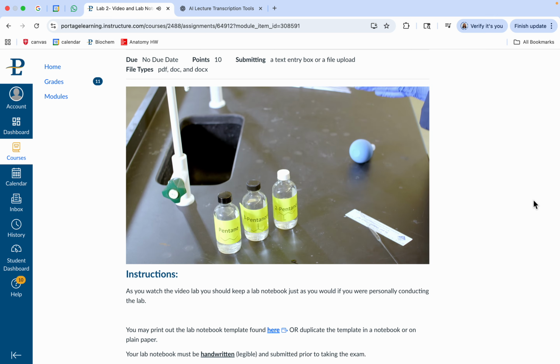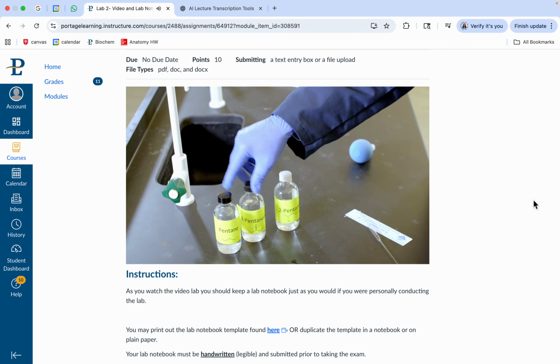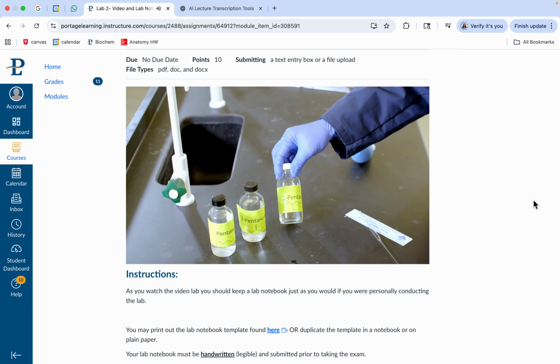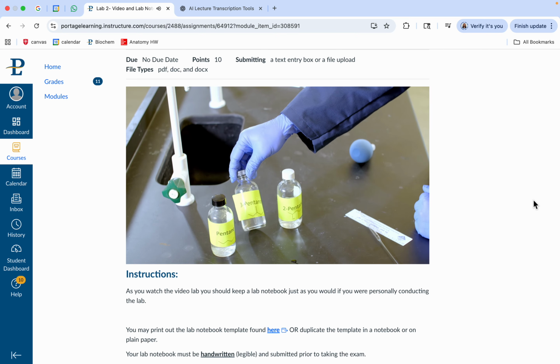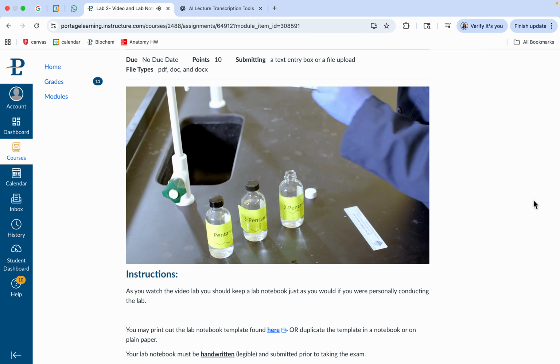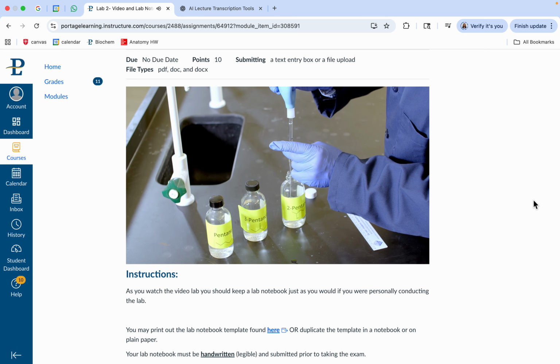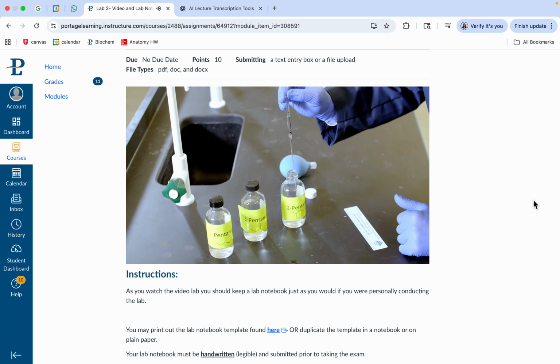So in this next part, we're going to actually look at pentanol, and particularly you should notice the structures on all of these. We've been showing them on the bottles, so make sure you're recording those to make the correlation. But this one's 2-pentanol. Again, noticing that the OH group is coming off of the second carbon, and just to back up again, notice this was 3-pentanone. The ketone's on that third carbon, the middle one, and then pentane's just a straight carbon chain. So let's see if we can get some values now for pentanol. I'll get the pentanol in position. So now I have it ready, so I'll say start.